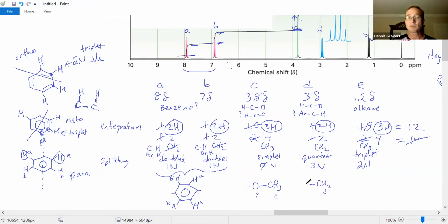And that might be next to an oxygen. Put a question mark there. And what was the other suggestion? Maybe it's attached to the benzene ring. Maybe on this side. Away, I'm going to put oxygens on that side. That's another question mark. Peak E is a methyl group. I'm not sure where I want to put that. Probably over here maybe, or far downfield away from the benzene ring and the oxygens.